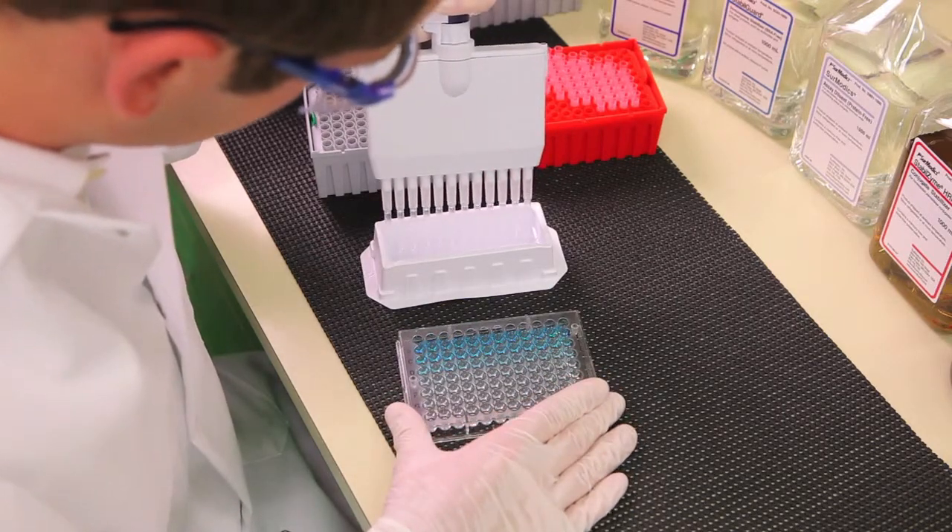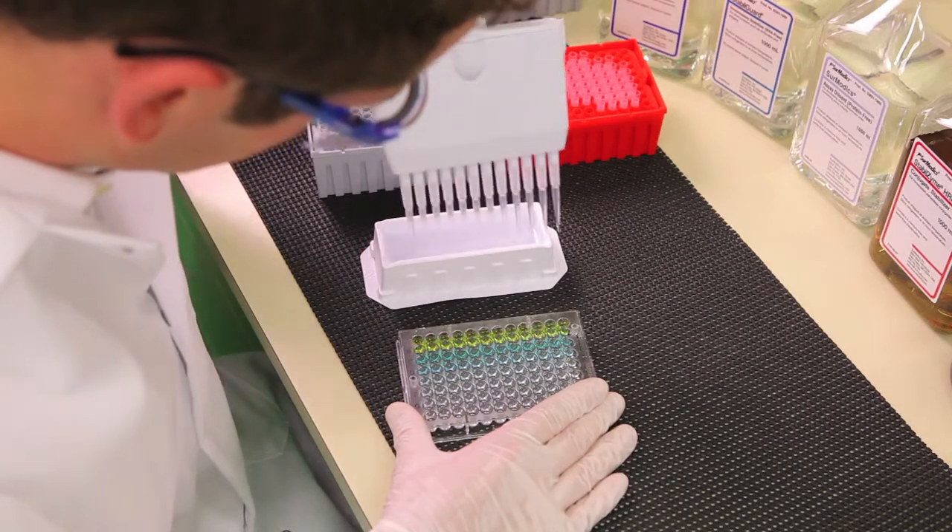Our BioFX TMB substrate line has formulations with different kinetic activity levels, allowing the researcher to optimize the reaction time of their assay. The reaction is stopped using Surmodics Stop Solution, which converts blue TMB product to yellow, that can be monitored at 450 nanometers.